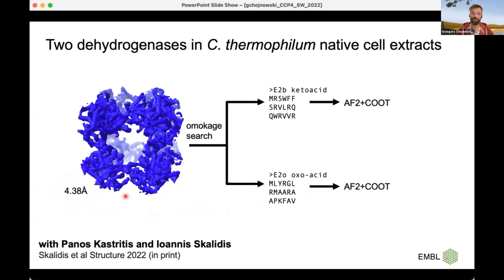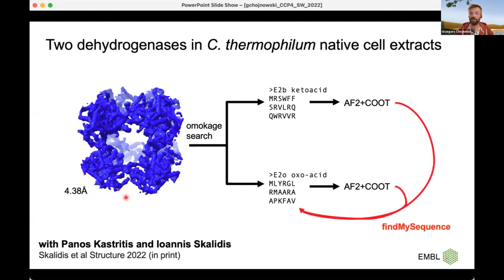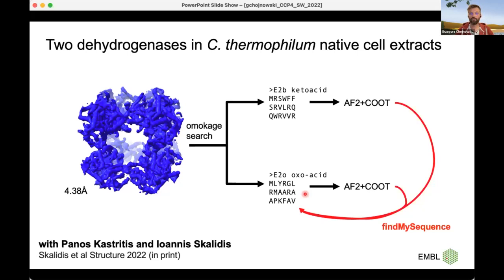FindMySequence, using the complete model, identified both models as the oxygenase — even though the first one scored slightly worse than the other. This shows how powerful the combination of the neural network sequence identifier with AlphaFold structure prediction is for identifying structures. I used FindMySequence here to validate a hypothesis — I had two different solutions and used FindMySequence to find the correct one. It's basically hypothesis testing for global structure.